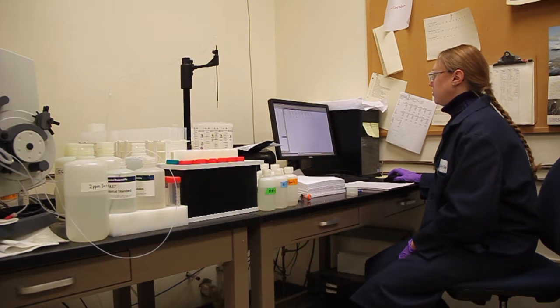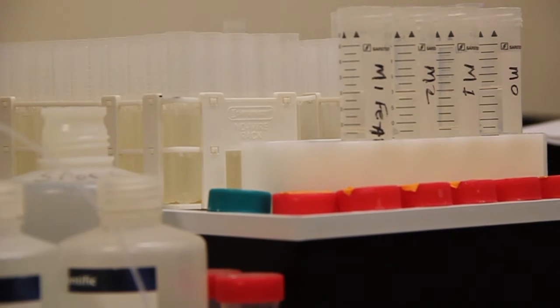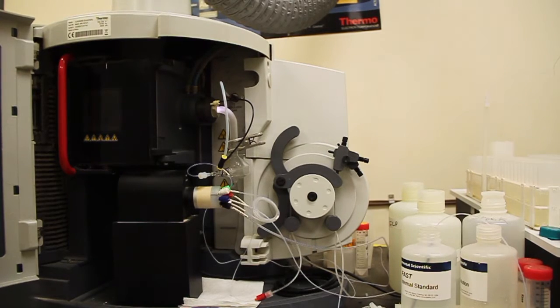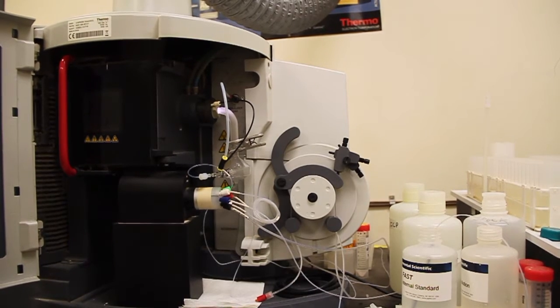Then samples are off to the ICP for elemental analysis. All of the data is run through the lab information software, or LIMS system, which calculates results back to parts per million. The results are then sent to the farm or downloaded into the ACS software.